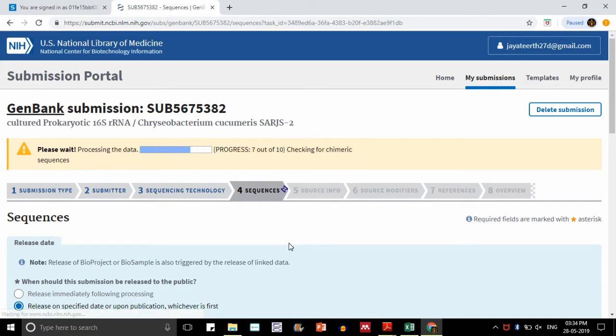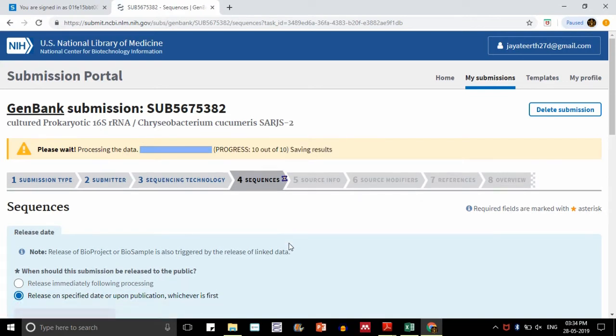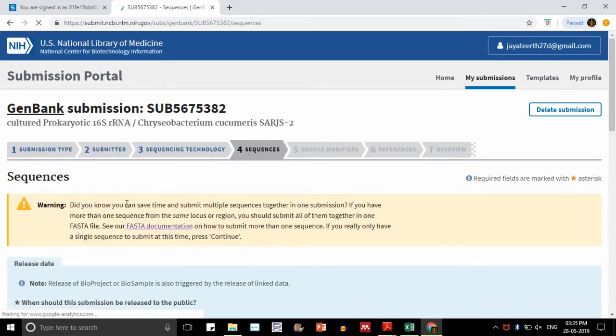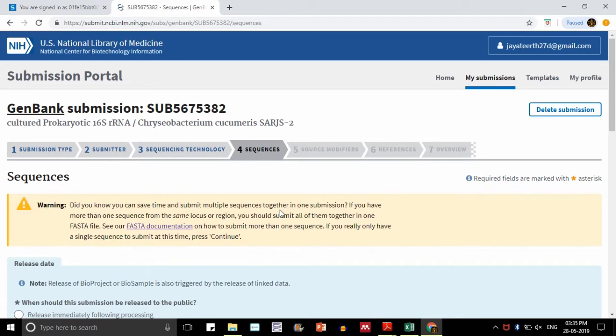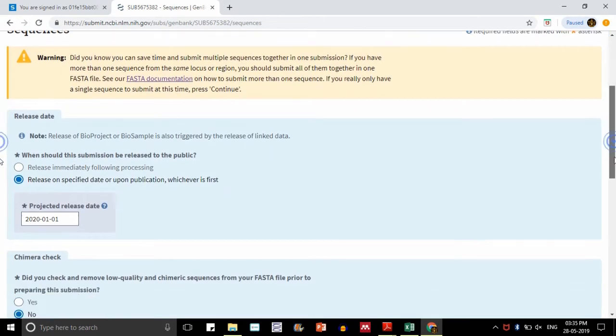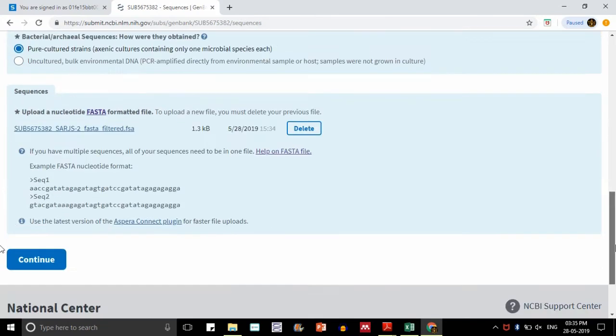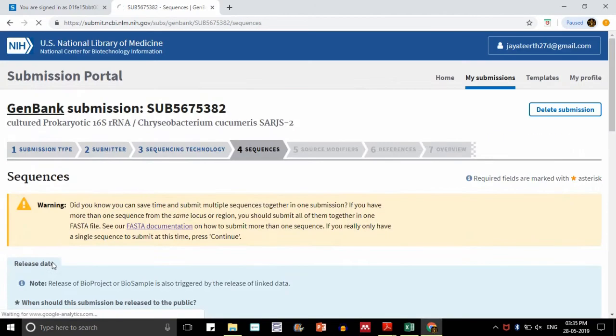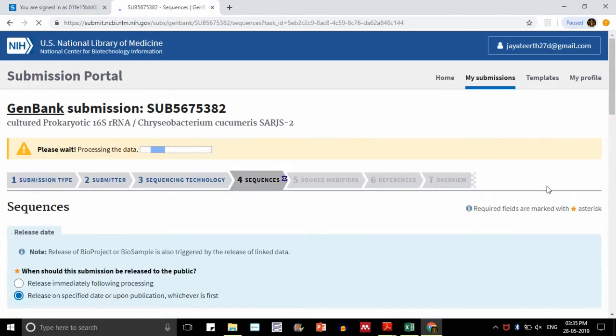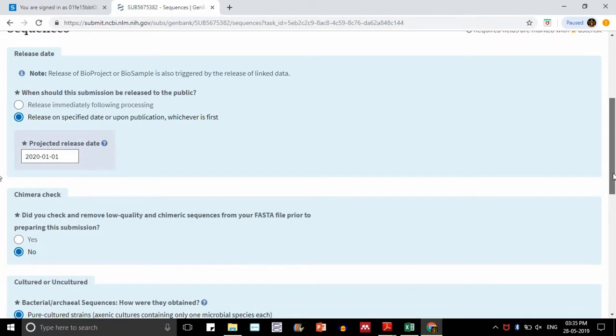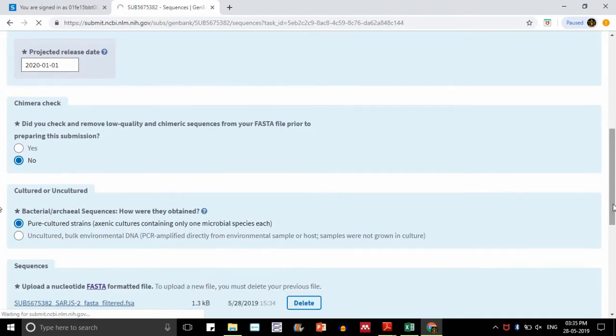It is taking some time for processing the data. There are 10 steps here, all 10 steps are done. We will go to the next step now. It is asking us if you have any more sequences, multiple sequences, you can upload it all together as one file or multiple files here. I do not have any sequence, so I need not worry about this. I am just saying continue.